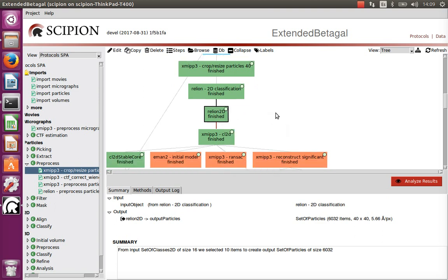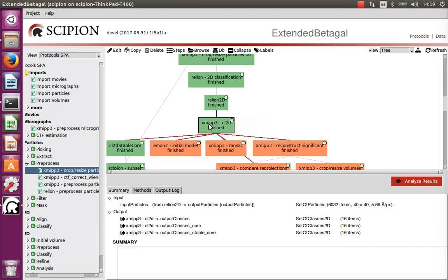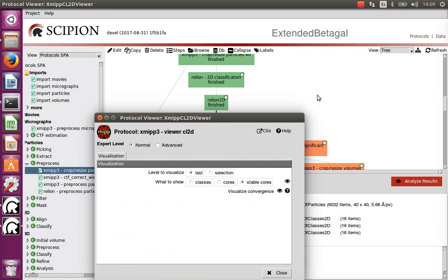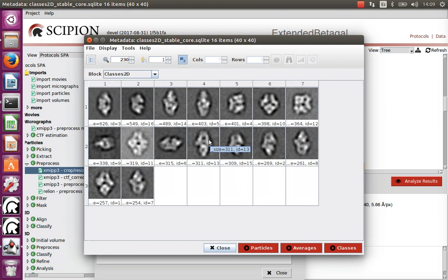The particles classified as good by RELION can be reclassified with a different algorithm. CL2D is very good at identifying different classes — we asked for 16 classes, but normally we could ask for many more: 32, 64, 100, whatever. The classes are well separated into distinct clusters. The problem with CL2D is that bad images are spread across all clusters, contaminating each class a little bit, since there are relatively few bad images compared to good ones in each class.